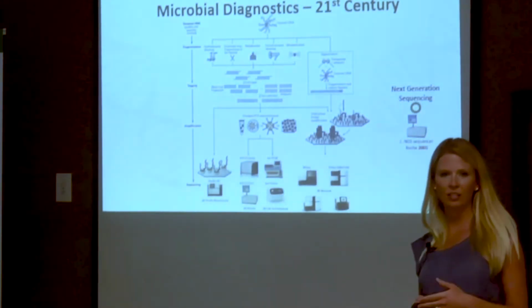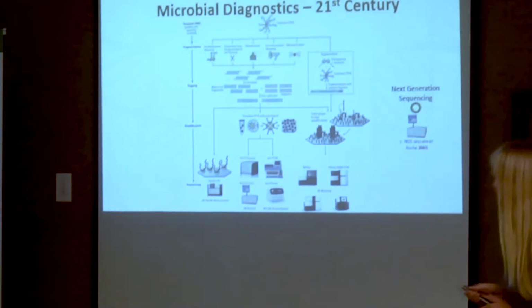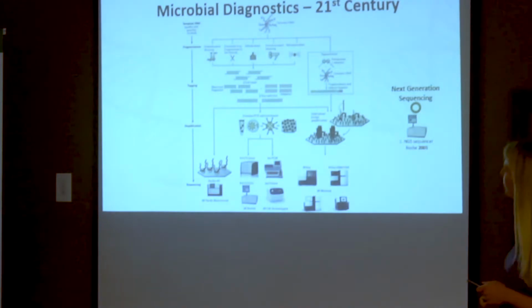And I keep mentioning next generation sequencing, and I just want to go over very briefly what it is. Like I said, it's not that new anymore. It was developed in 2005. The first sequencer became publicly available.